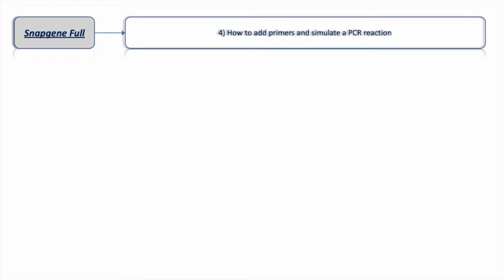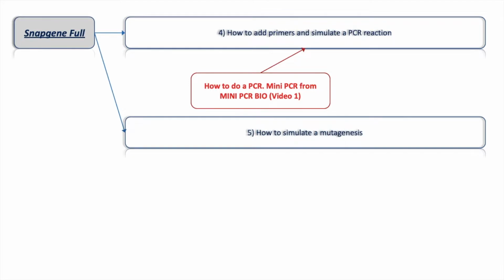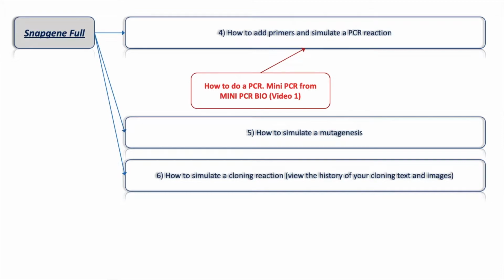Number four, I'm going to show you how to add primers and simulate different PCR reactions. I do also have a video about that regarding hands-on. Then I'm going to show you how to simulate mutagenesis, and of course how to simulate cloning reactions and basically view the history of your cloning in different text and images and how to export them and so on.